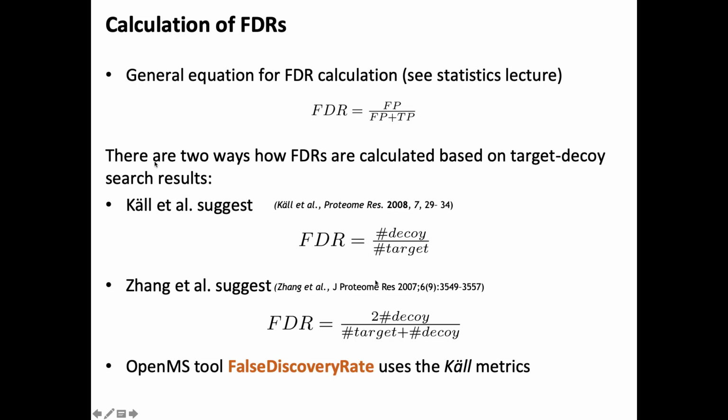And using this simple trick, you can force arbitrary search engines to compute false discovery rates, just by doing this ad hoc and by trying to recompute the false discovery rate after the fact. Note that this is the false discovery rate on the peptide spectrum match level. So if you have 1% FDR, what does that mean for the number of correctly identified proteins?